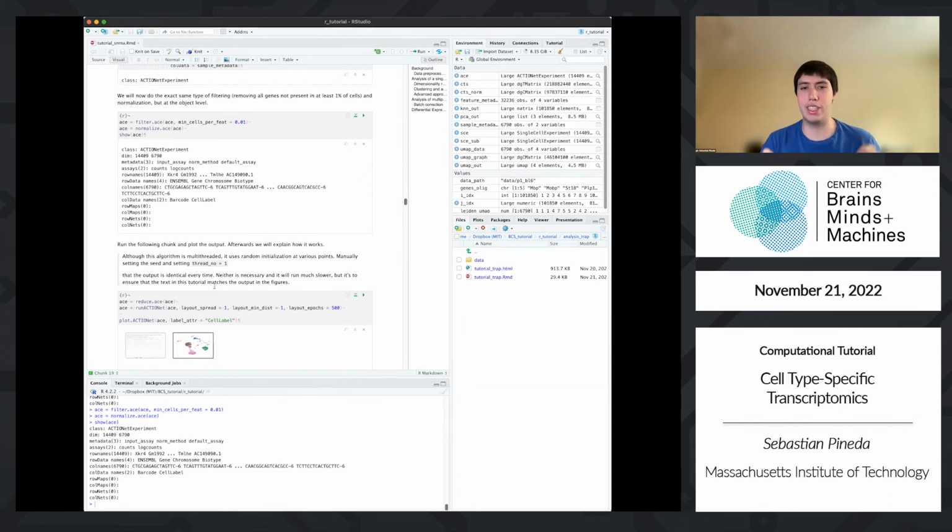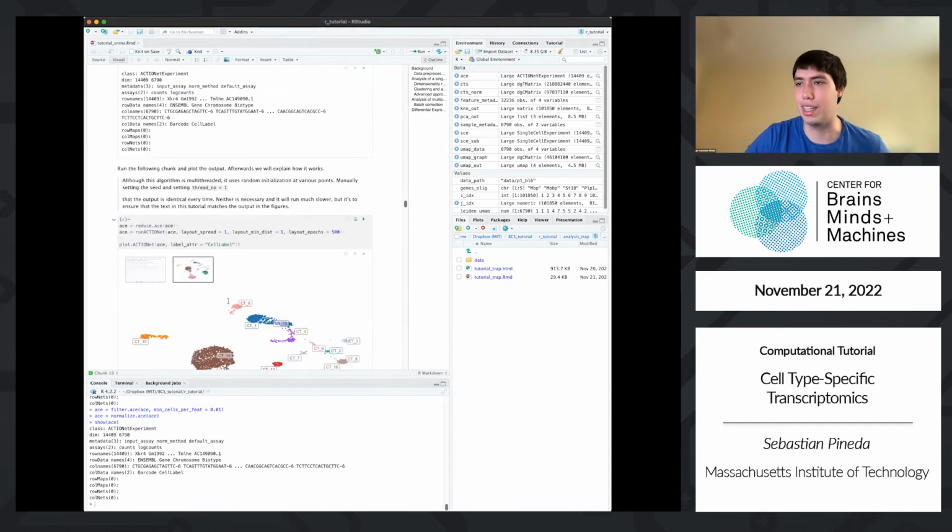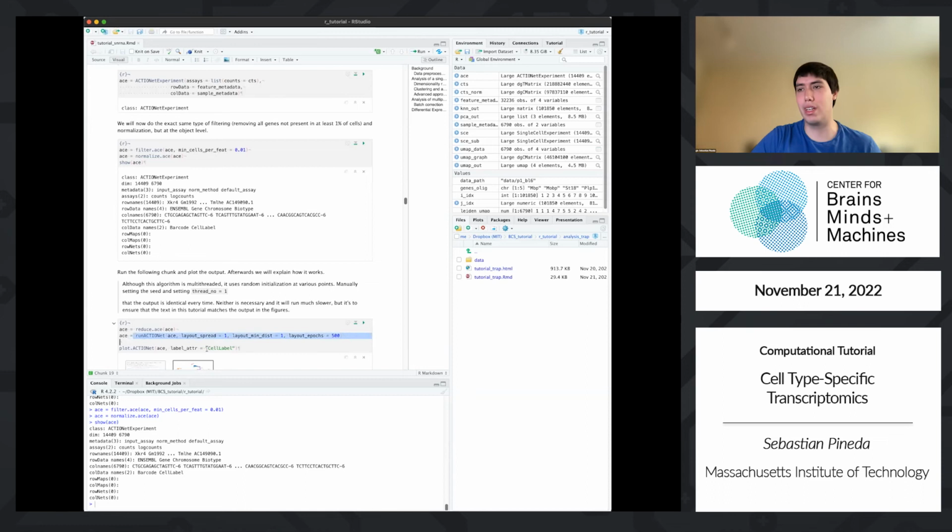We can use something called the Jensen-Shannon distance. The Jensen-Shannon divergence is a measure of how similar or dissimilar two distributions are, two probability distributions, really. But we can pretend that gene expression distributions are probability distributions, and this works quite well. And then we take the square root of this value, and it gives us something that is actually a metric, which means that if you move the 2 points around in space, their relative distances stay the same. And this gives us a measure of cell-to-cell similarity for every single cell in our data set. And this allows us to do some very fancy things, like I'll show you. So right off the bat, we run this algorithm.